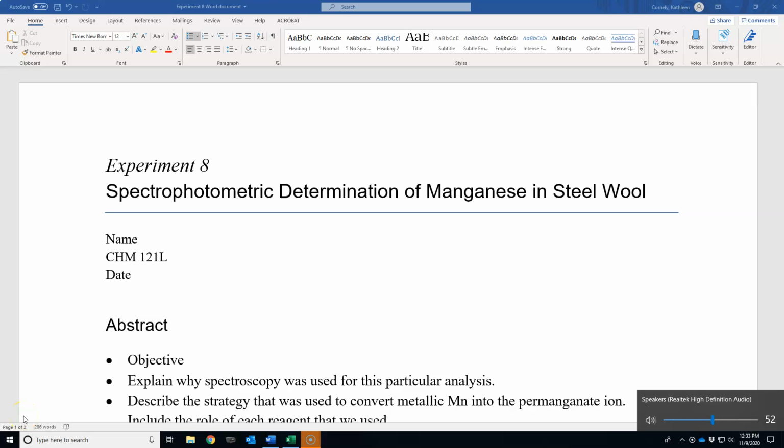Hello everyone! The purpose of this video is to explain the expectations for your lab report for Experiment 8, spectrophotometric determination of manganese in steel wool. So I have a Word document here, so you should submit a Word document that looks similar.